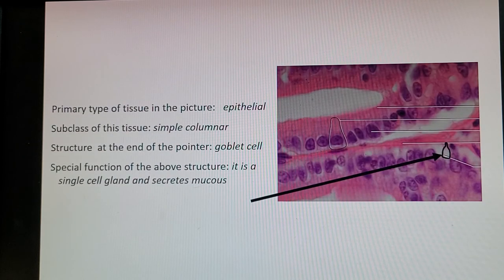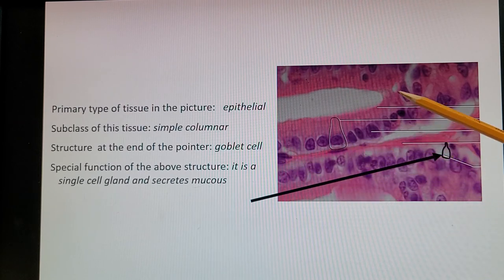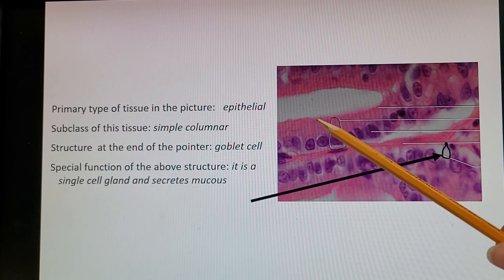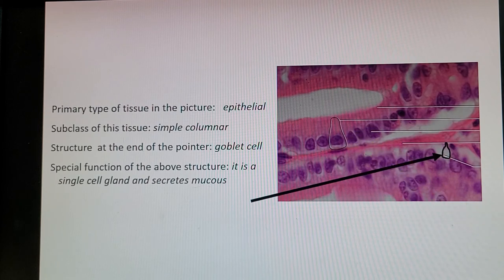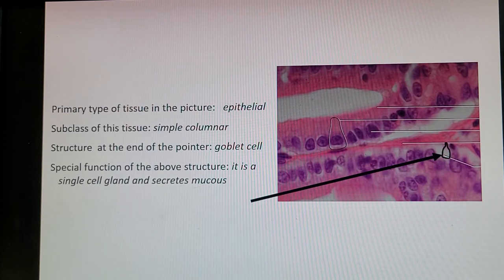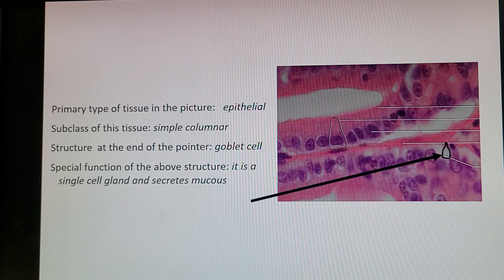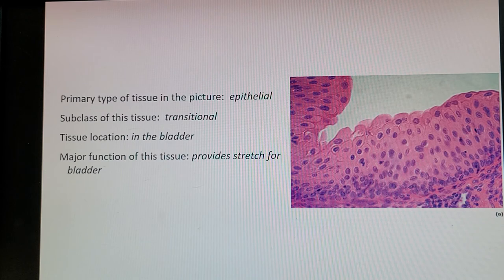Next picture shows epithelial tissue — simple columnar. The basement membrane is visible, forming a tube structure. The outline shows the cell is taller than it is wide — columnar. The structure at the end of the pointer is a goblet cell, shaped like a wine glass with a cup section and a little stem. The goblet cell is a single-cell gland and its function is to secrete mucus. That function is one of the questions on the actual exam.